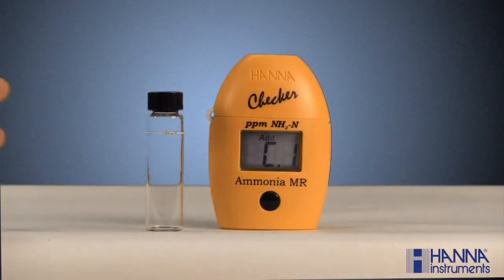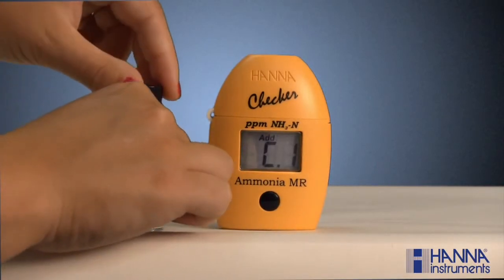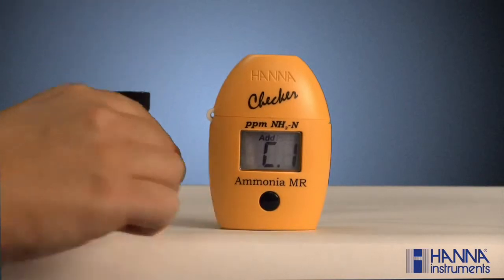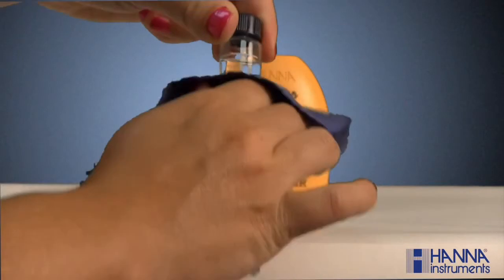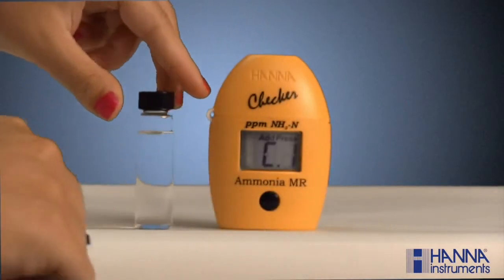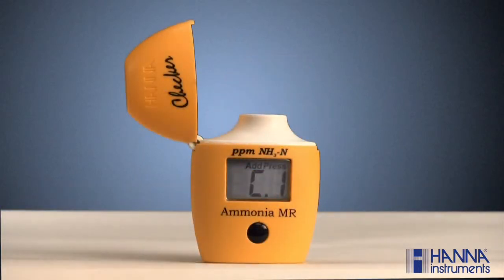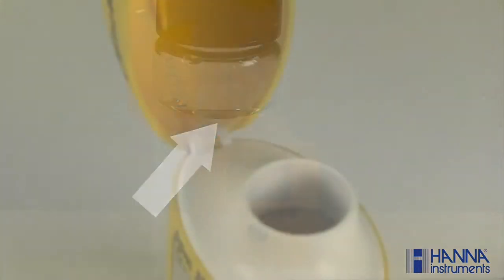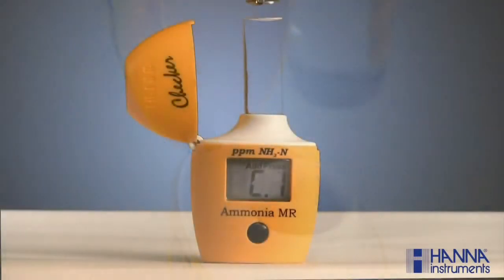Next, fill a cuvette with 10 milliliters of unreacted sample and replace the cap. Make sure the cuvette is dry and void of fingerprints by wiping it down with a lint-free cloth, such as our HI-731318, which is sold separately. Place the cuvette in the checker. Be sure to align the break in the cuvette's 10 milliliter line approximately with the hinge of the checker, and close the cover.